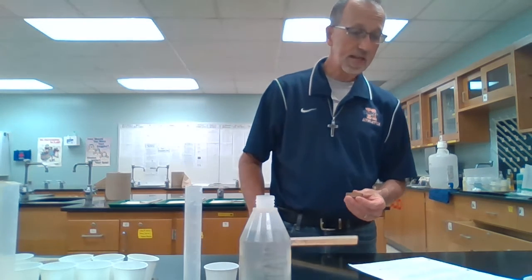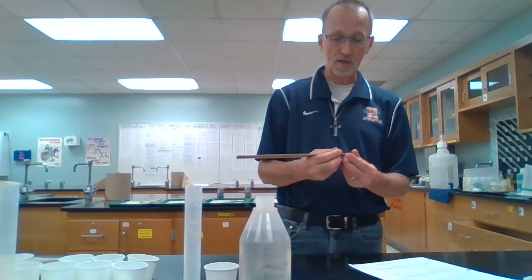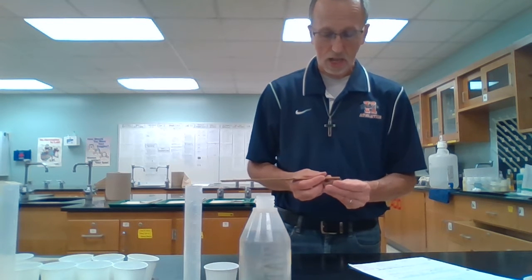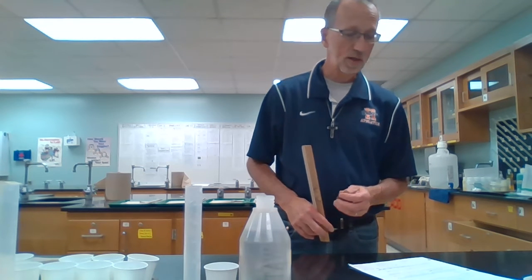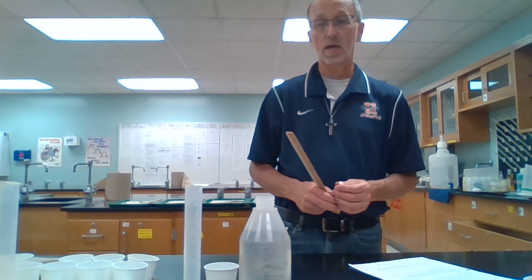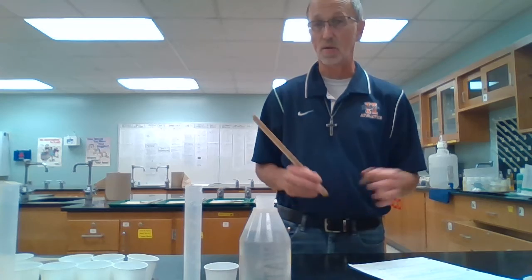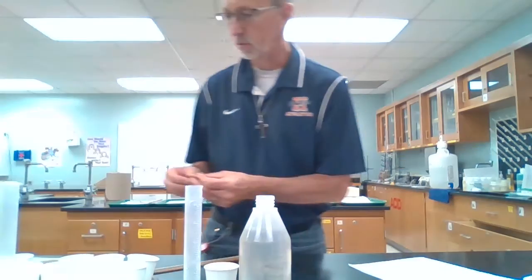And that puts us at a volume, according to my calculations, and this would be to 3 sig figs because all my measurements have 3 sig figs since I went to 2 decimal places, of 6.16 centimeters cubed for number 5. That is also equivalent to 6.16 mL, so either way. All right, we'll put that one back.